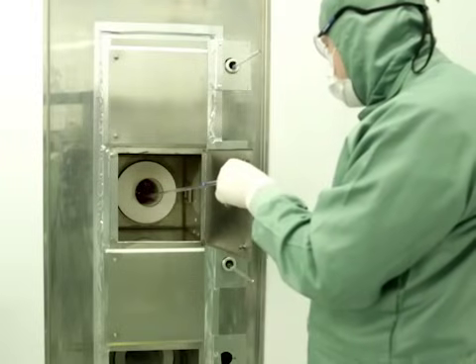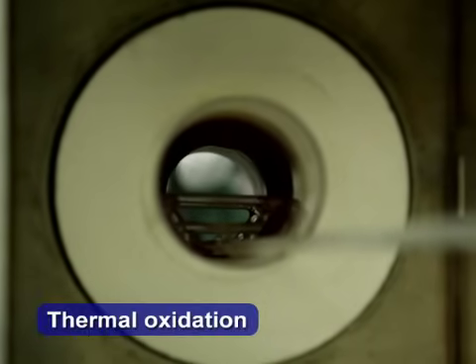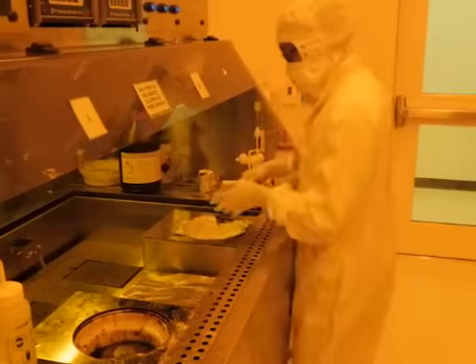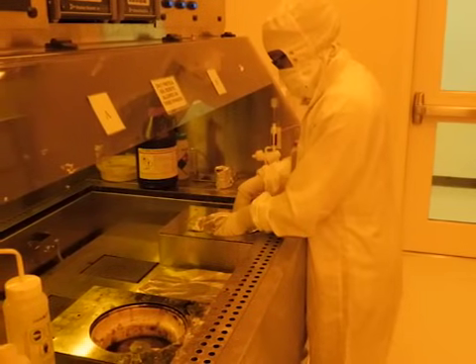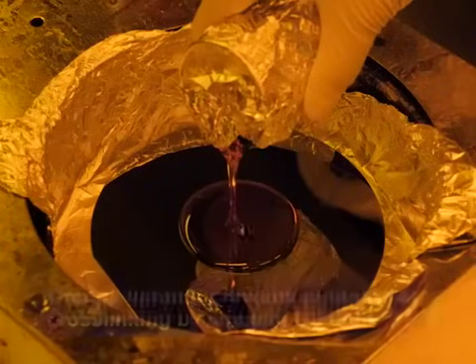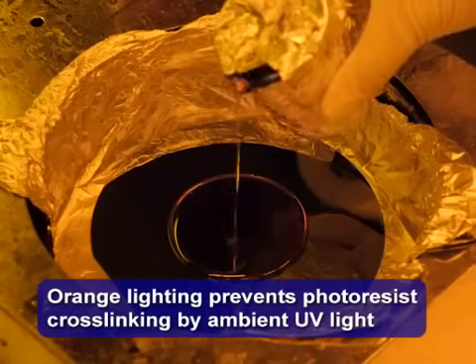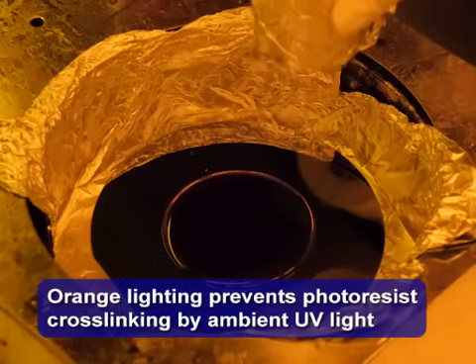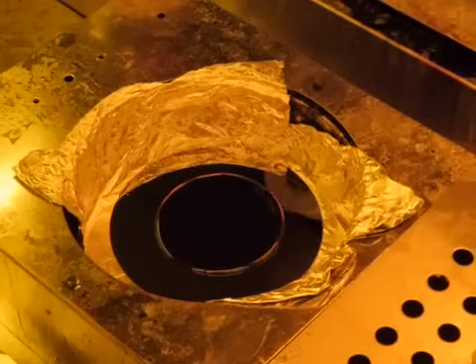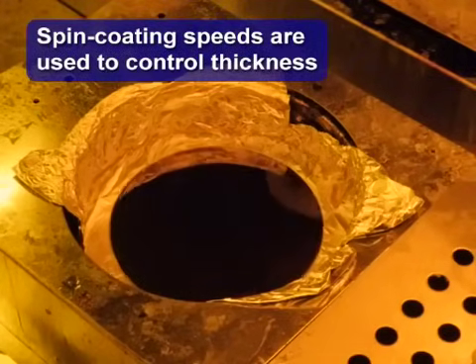First, a silicon dioxide layer is formed on the silicon wafer surface using thermal oxidation. Once the wafer is oxidized, it is placed on a spin-coater chuck. Photoresist is poured into the center of the wafer until it covers most of the wafer surface. The photoresist is then spin-coated to create an even, thin coating.